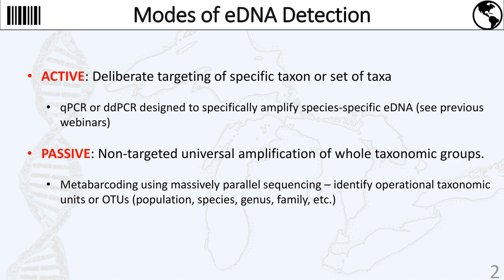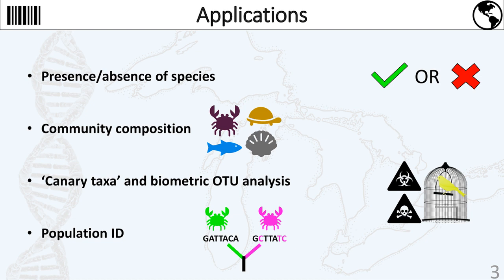Depending upon the number of barcoding sequences used, one can assess a subset of taxa, for example, purely just amphibians, or even representatives of all life forms found along the entire tree of life from a single sample. The adoption of eDNA metabarcoding to applied ecological issues quickly cemented its role as a hugely informative method to derive massive amounts of information of aquatic and terrestrial taxa from all manner of environmental samples.